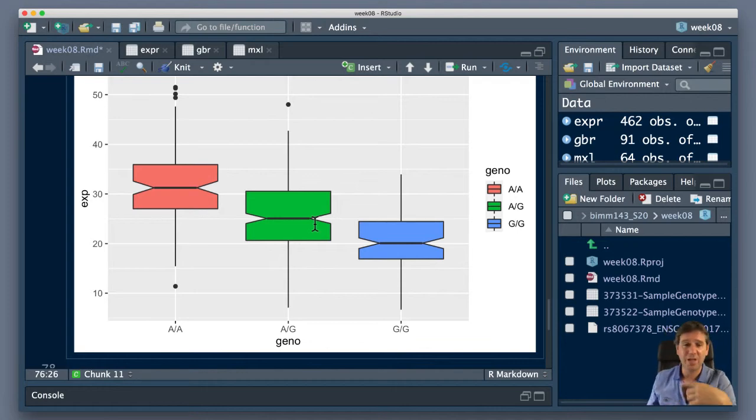Okay, so we've kind of run our course here and we've done a lot of different things. We've actually analyzed a ton of data. We've repeated this published study in a large sense that we're going to talk about next day. We went and found some variants that are associated with a particular condition that we were tasked to analyze, this childhood asthma in this case. We found some SNPs that seemed to be associated from other people's work, from genome-wide association studies, from Verlaan and colleagues. We tracked those SNPs down to chromosome 17, to their location. We found genes that are in the vicinity of those SNPs. We focused in on a handful of them, or actually just one of them at the end.